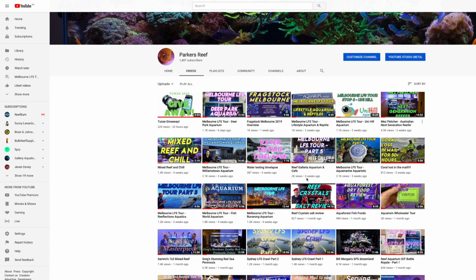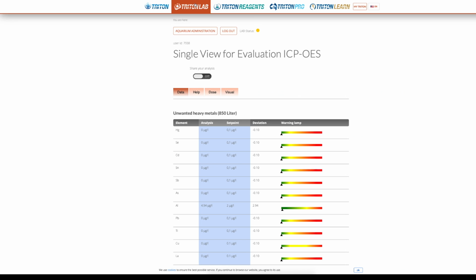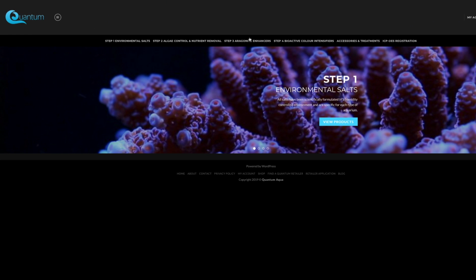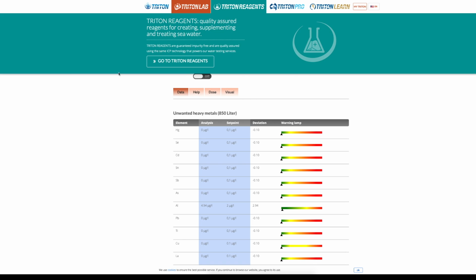The only problem is it's going to be a different sample from the other 3 we've done, so I won't be able to compare apples with apples, but I will get a review in of the MarinLab ICP, just so that we get a good coverage of all 4. So that does leave us with 3 companies. We've got Triton, the original, or the industry benchmark in Australia. We have ATI, and the new player on the Australian market, Quantum. So let's jump into it and compare these 3 and see what we got.